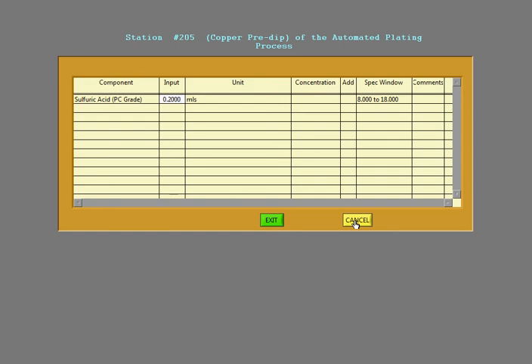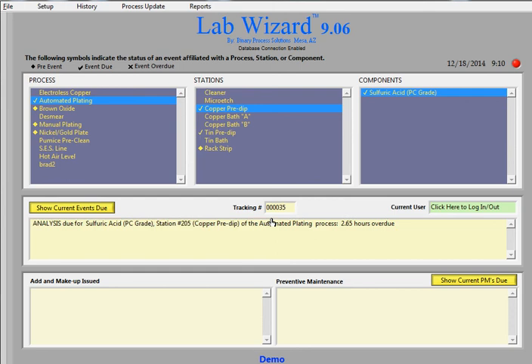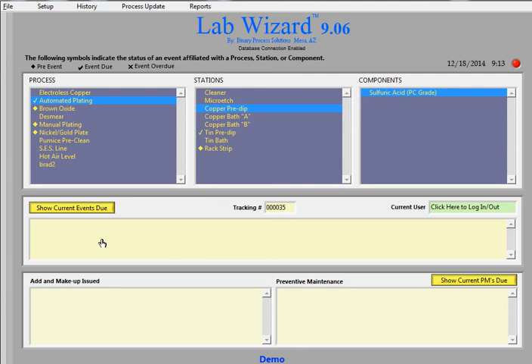So after the analysis has been done, we hit the exit button. And we get back to the screen. And now the event has been cleared. So I had changed the input so that it wasn't out of spec. And if it had been out of spec, an add screen would have come up.